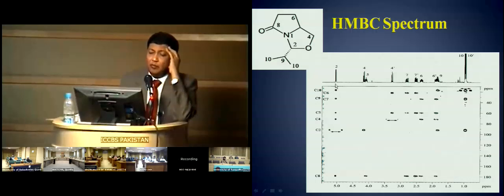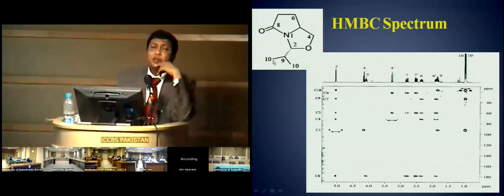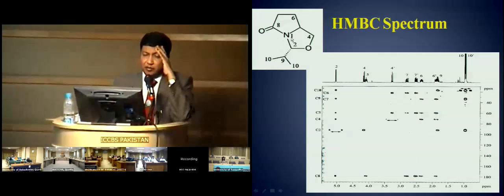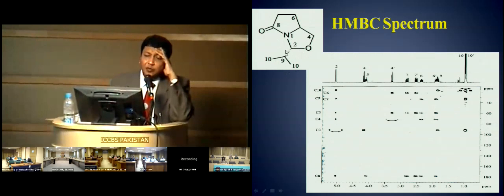So you are capable of linking the fragments together by using an HMBC spectrum. You get a gross structure, you make bits and pieces. Always remember, when you record an NMR spectrum and do lots of TOCSY and NOESY and COSY and so on, you would get this peak. This will be your fragment, right? And this fragment, which has two methyls, a methine and a methine, which is a very downfield methine, you would see that all of them would be coupled with each other in TOCSY.